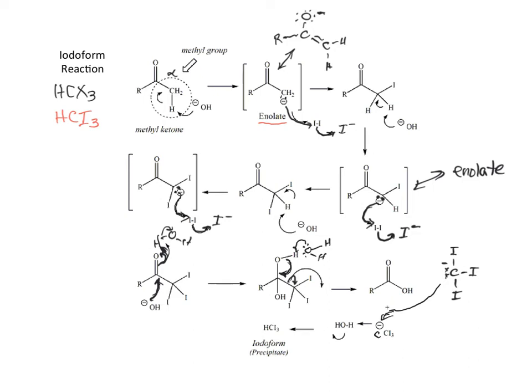It can react with water. It deprotonates water, and we get iodoform as our product, and iodoform precipitates. And it is a light yellow color.